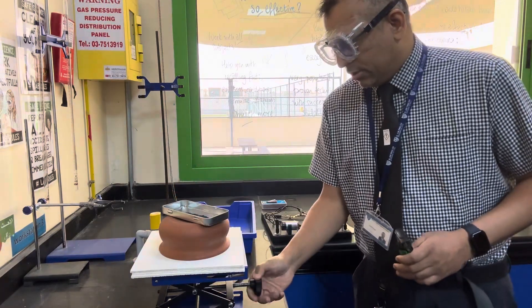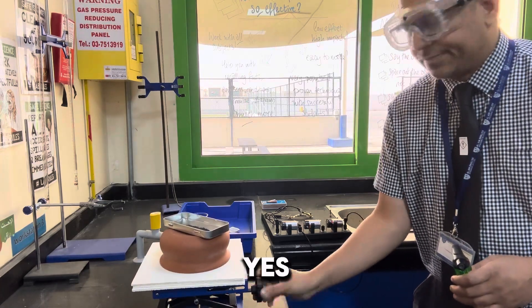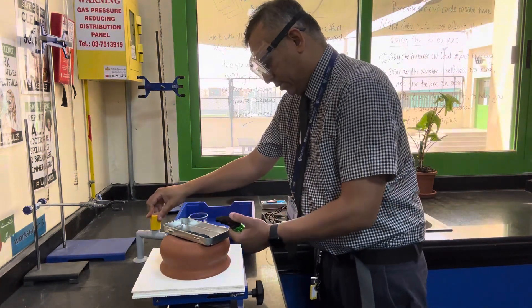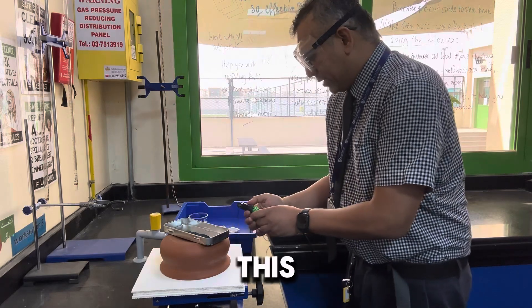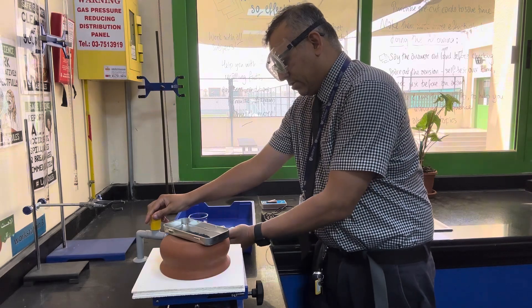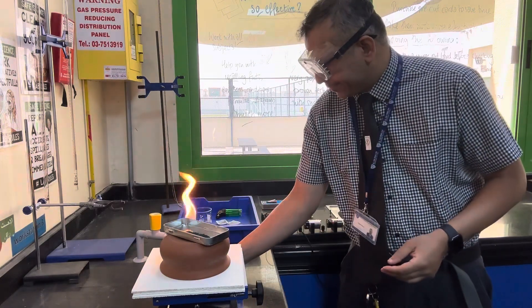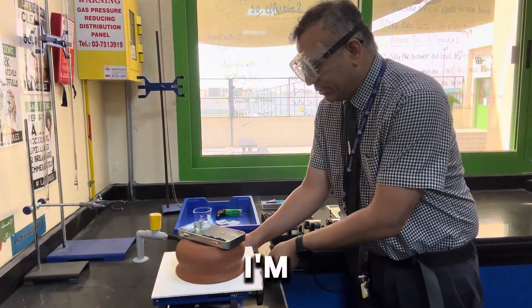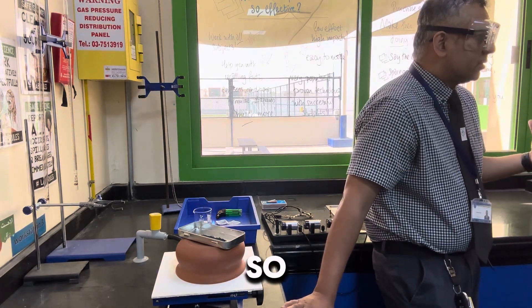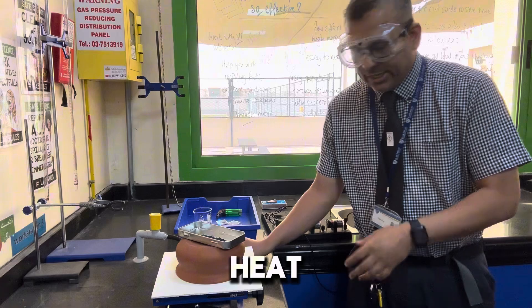Are we ready? Are we ready? Yes. Super. Let's get on with it. This is usually the moment where I find that the gas is not working. Oh, good. So I'm a trained professional — we don't go around holding Bunsen burners like this, okay? Don't do it. So what I'm going to do is just heat this.